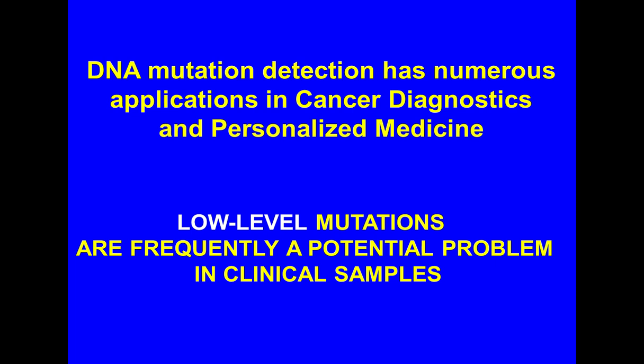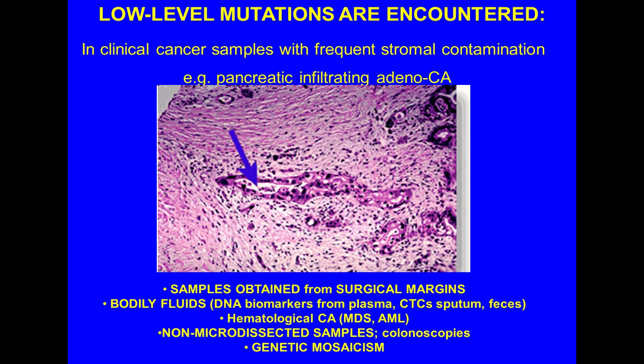They have major clinical significance in many cases, but they are difficult to detect, with a lot of technical difficulties. Some examples: low-level mutations are encountered, I would say, in the majority of clinical samples.